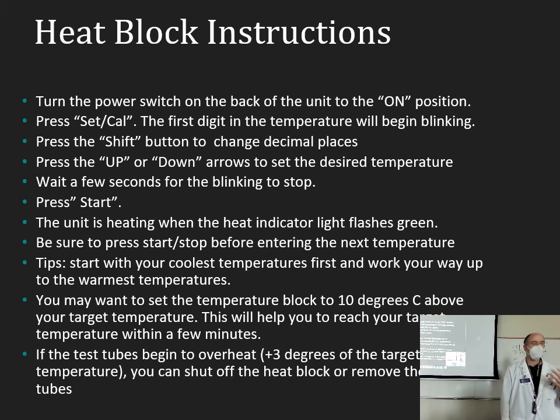If your test tubes begin to overheat or get too cold, you can pull them out of that heat block. Make sure you also check that test tubes are not gross. These, for example, have some crap in them, or water at least, so you might want to clean those out and yell at the last lab to talk. You might make sure your equipment's clean, make sure you don't mix up your pipettes just like last time. You want to make sure you don't get your yeast pipette mixed in with your peroxide pipette.